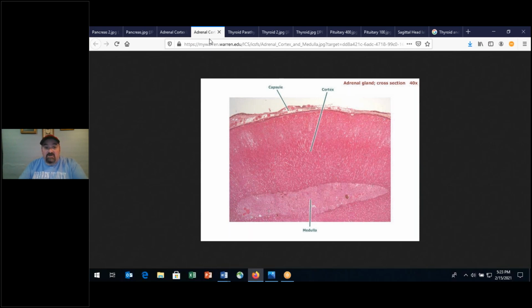Well, in the adrenal gland, we also have neural tissue as far as the adrenal medulla, the very core portion of the adrenal gland, and then the outer portion, the cortex, this would be glandular tissue, okay? And there's a capsule that encompasses, and that you can see on the histology slides, the capsule of the adrenal gland. And then what we're going to see, folks, is that, let's see if this one has it here.